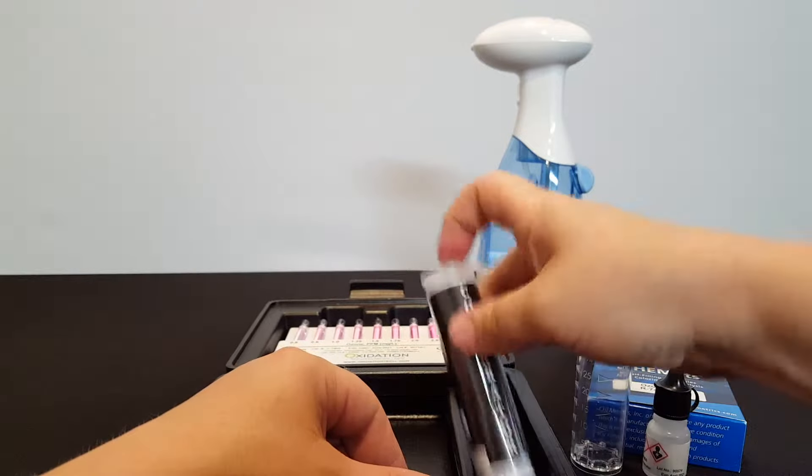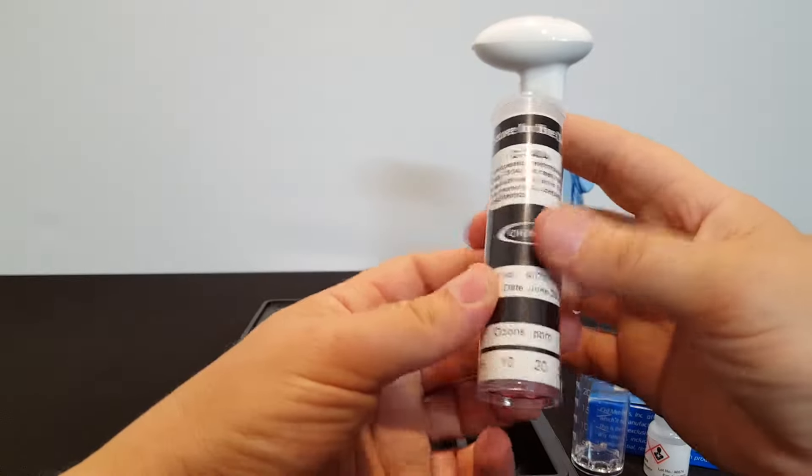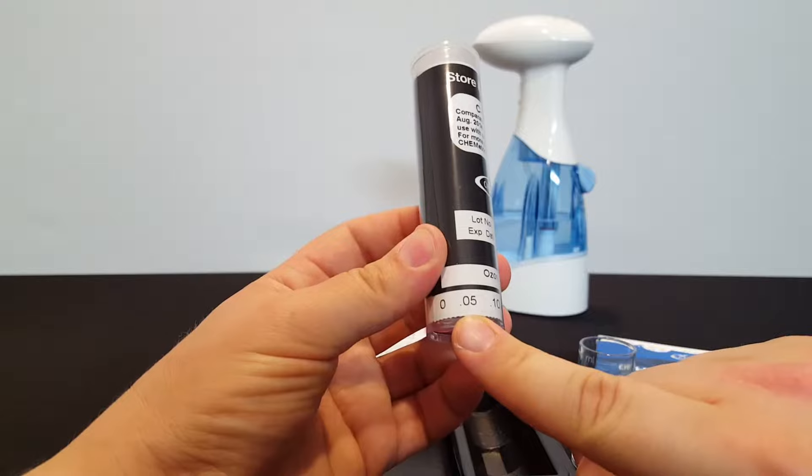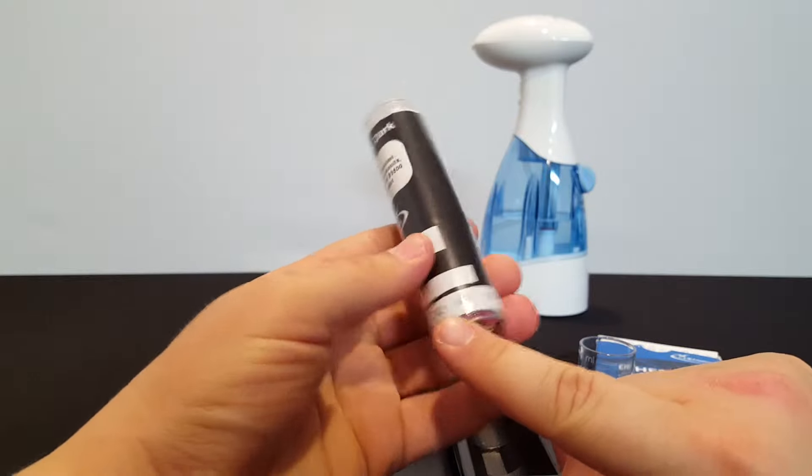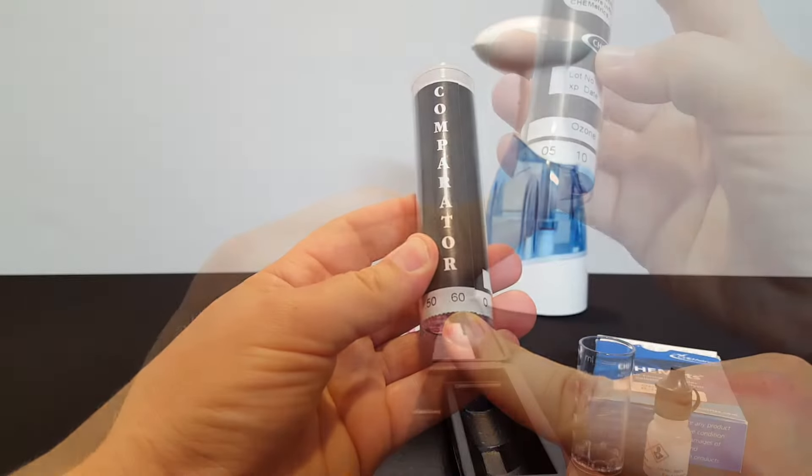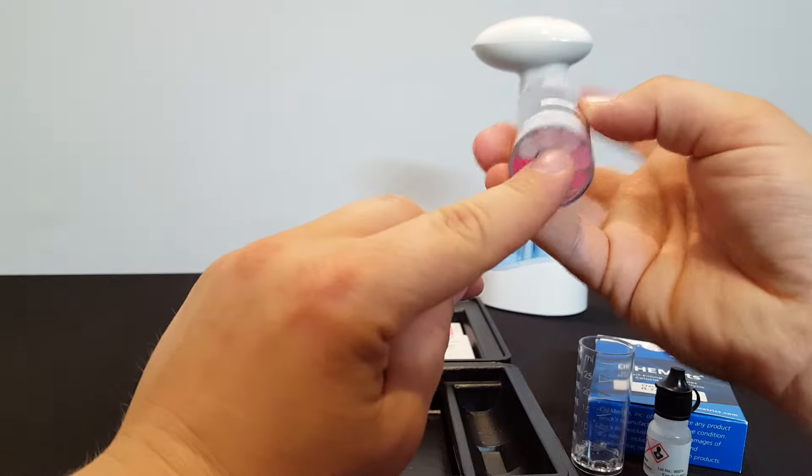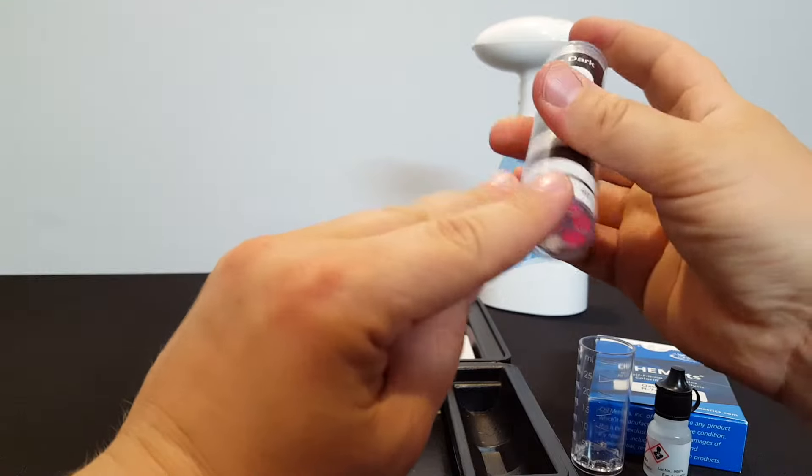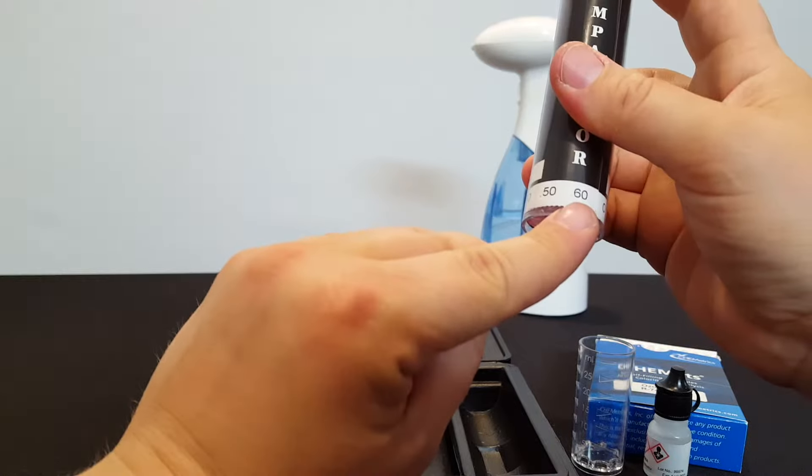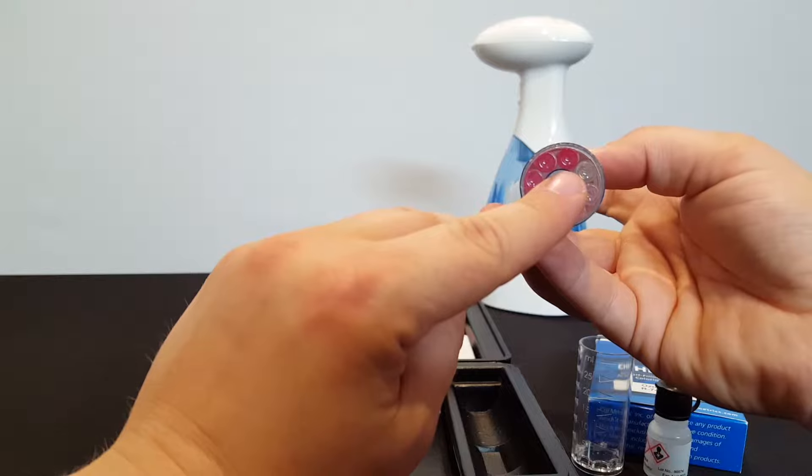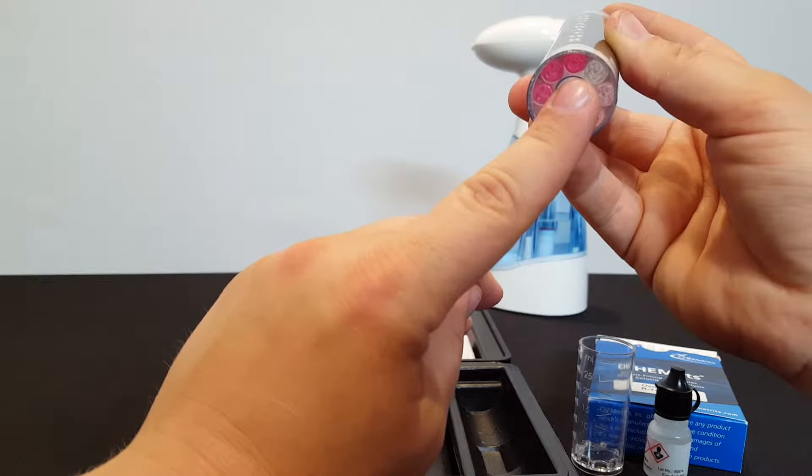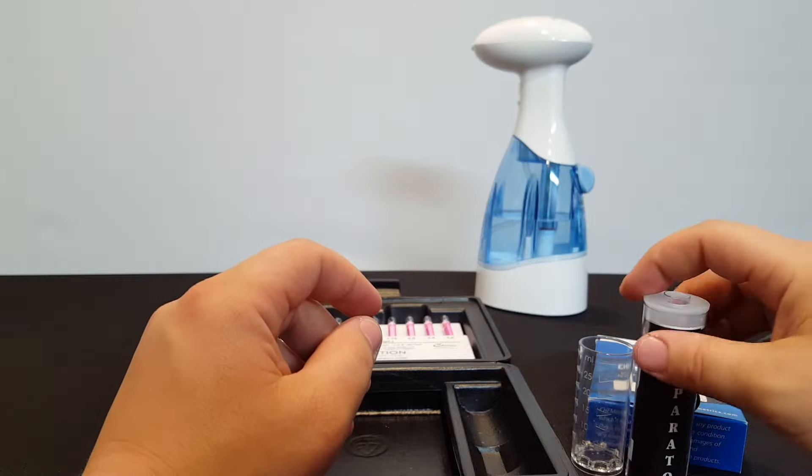The other parts of the kit that are reusable are the comparators. There's two comparators. The lower level comparator goes from 0.05 parts per million dissolved ozone, which is a very low pink color, up to 0.6 parts per million, which is a darker pink color. Darker pink indicates more dissolved ozone.